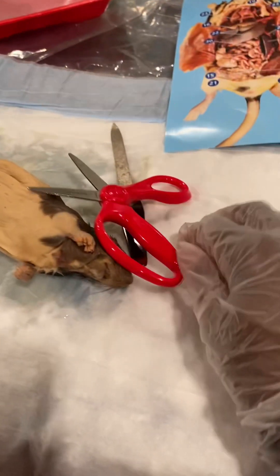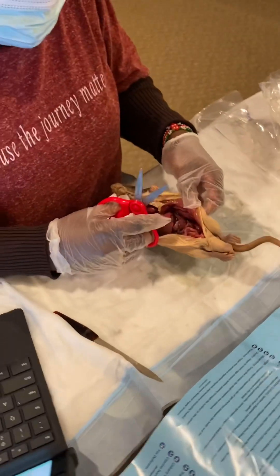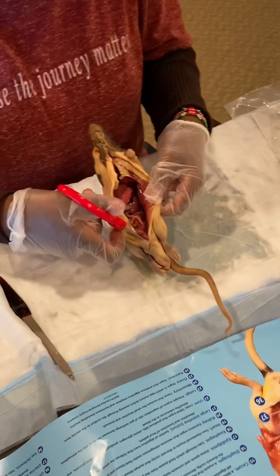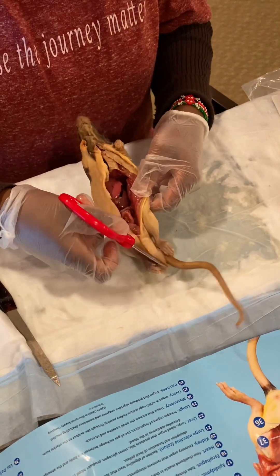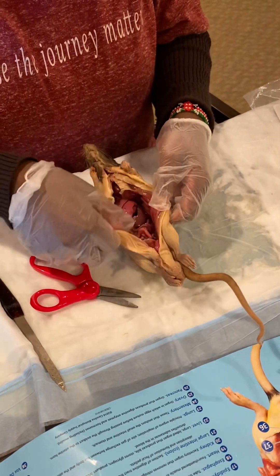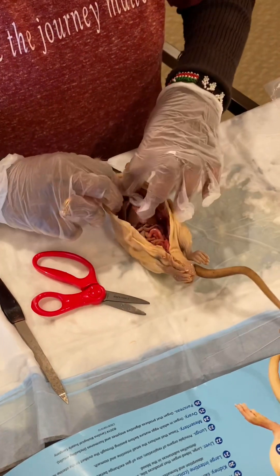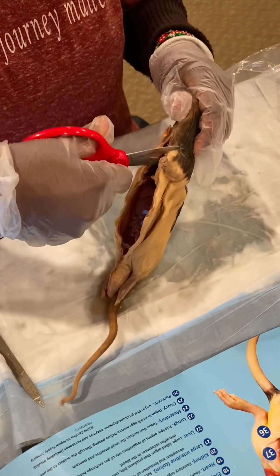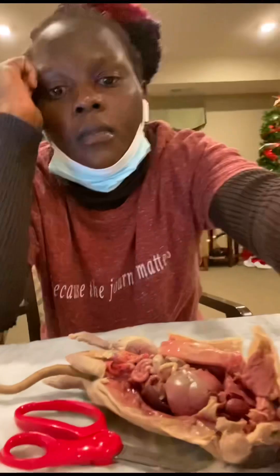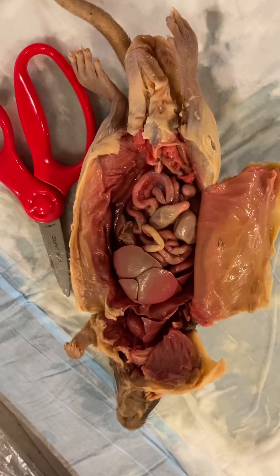So let's go — I'm trying to dissect here and trying to get the parts of the internal part of the rat. I'm making sure I follow the tutorial videos on how to dissect a rat. Don't worry about the water coming out — it's a preservative. I have already dissected this one and the entire thing is ready.